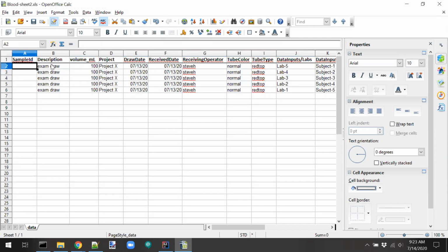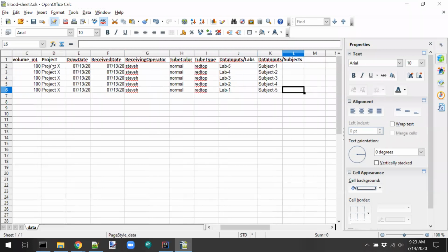Notice a couple of things here. Notice I am not including a sample ID. I could give these unique names, and they go right into the system by those names. But I'm going to leave it blank, and that's going to prompt the system to actually create a sample ID for me. I've configured the system to have a naming pattern that I want it to engage.